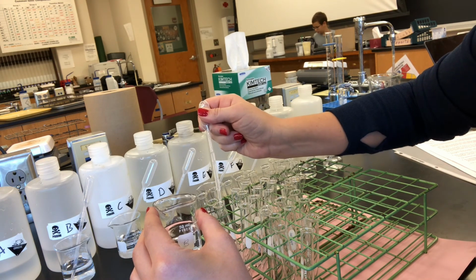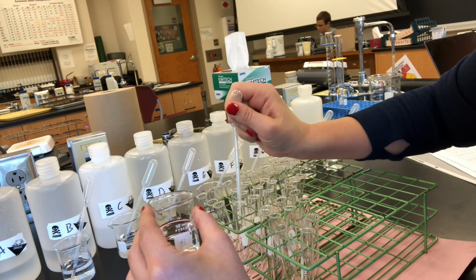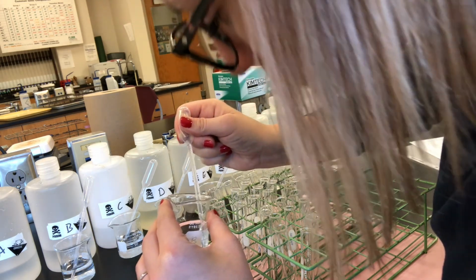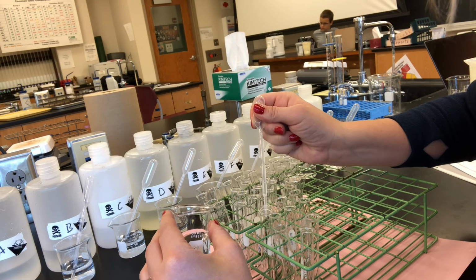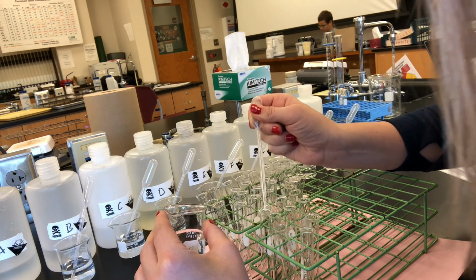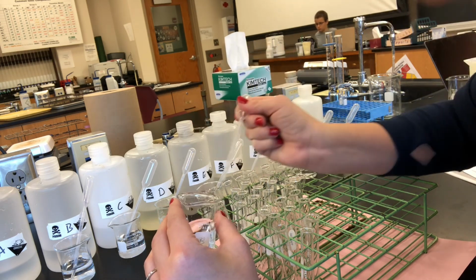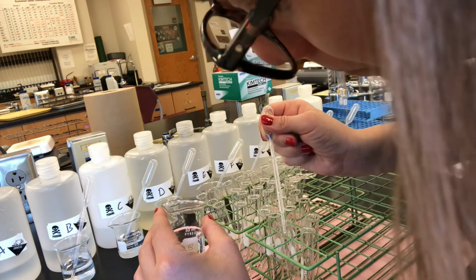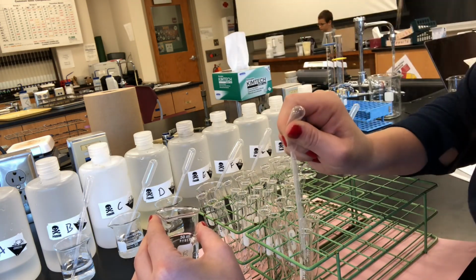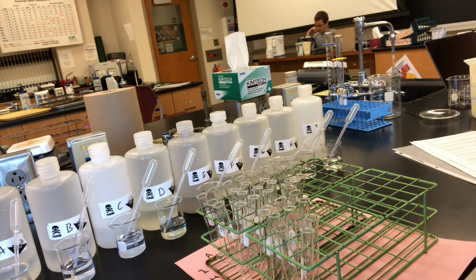Oops, make a little bit of a mess. But I always make a mess. So unknown A is a clear, colorless solution. I'm going to go through and add the second solution, and I'll make sure you guys can see it up close and personal. Okay, my first row has additions of unknown A across the board.